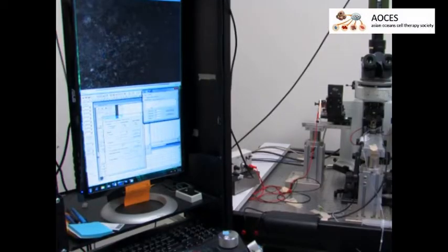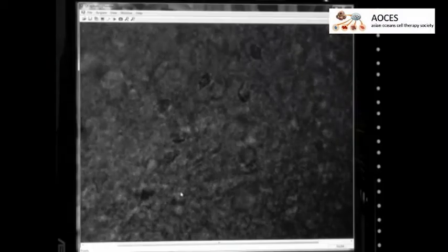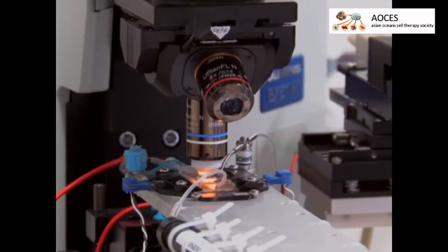Now, look for a target cell. Mark it on the computer screen in order to help guide the recording micropipette. Raise the objective lens to allow sufficient space for the placement of the recording micropipette.